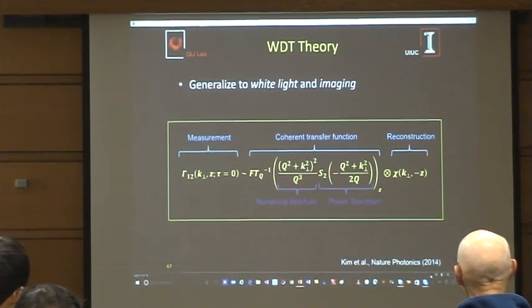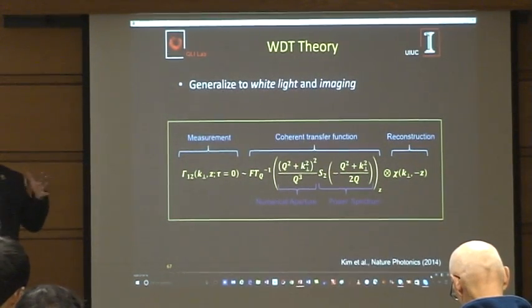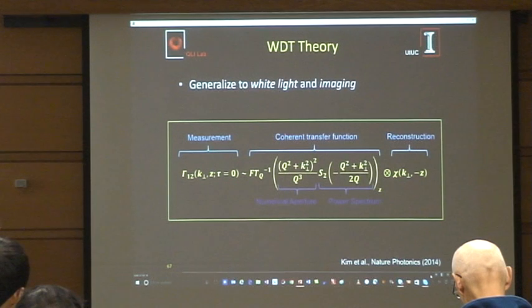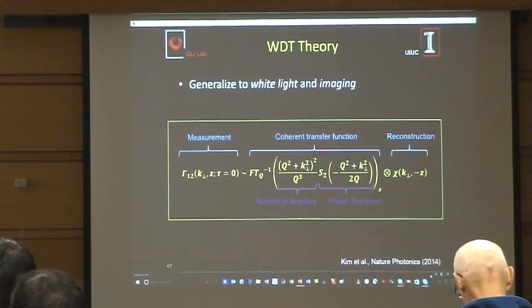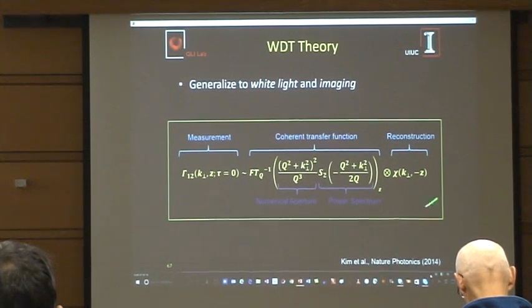There are a lot of scattering theories out there, particularly Wolf published this paper in the 60s, exactly based on this, how to use holographic data to get 3D reconstruction, solving inverse problems. The problem was there was a monochromatic field, and the second difference was it was a far field measurement, so it was a scattering measurement. So we had to do the calculation to generalize it for white light and bring it into the image plane. The image plane part is easy, but the broad spectrum part of it took us a long time. But anyway, we managed to do it.